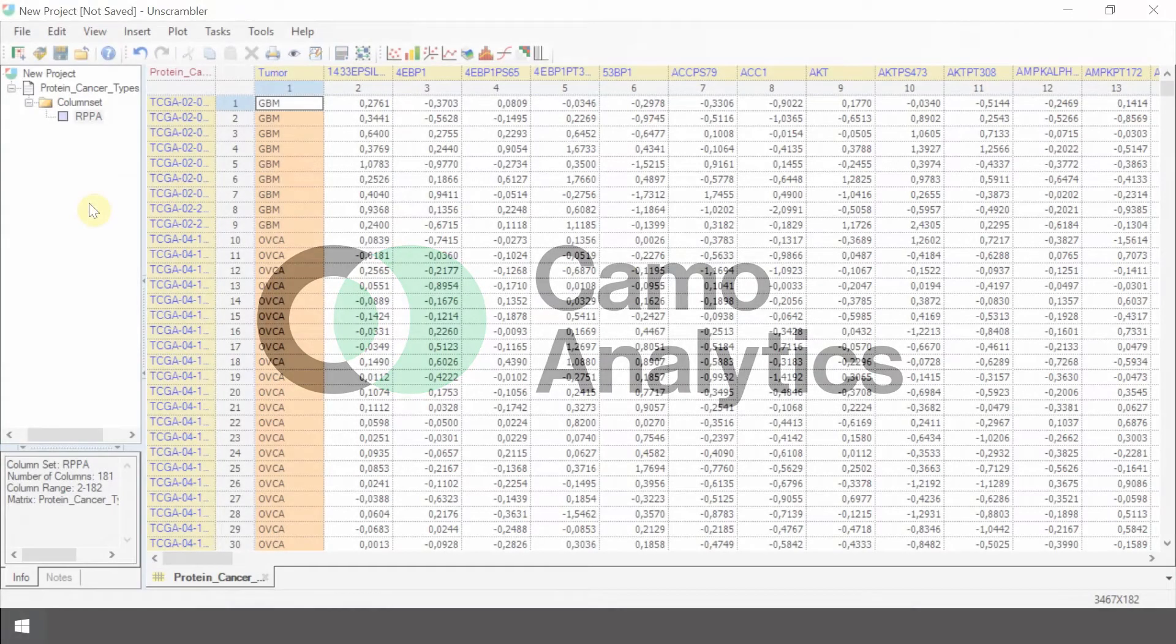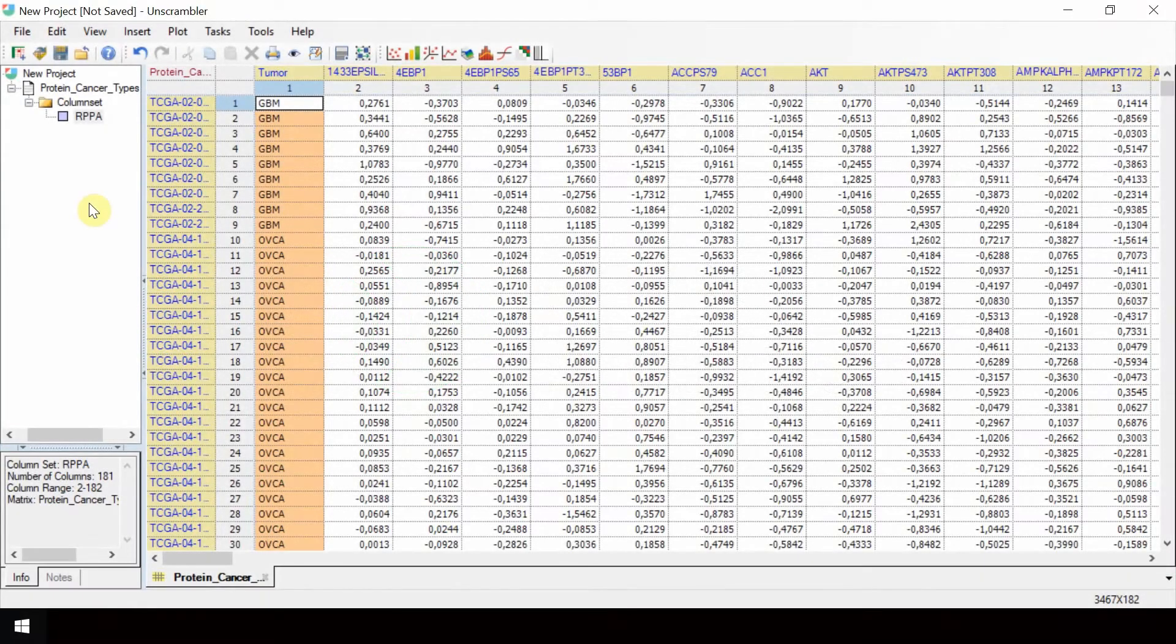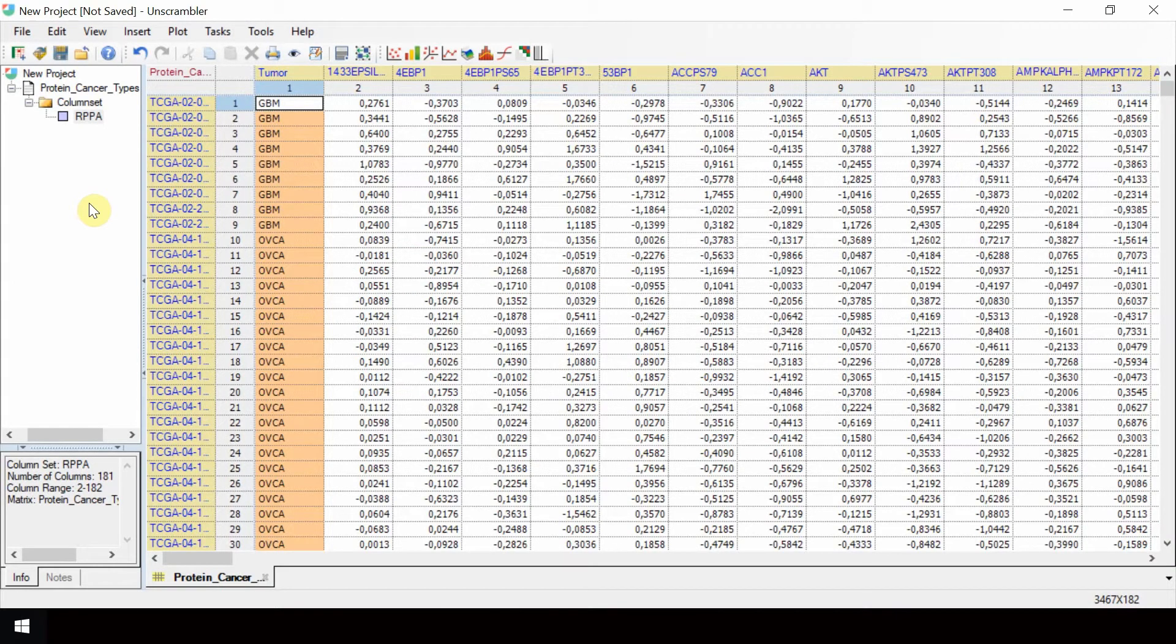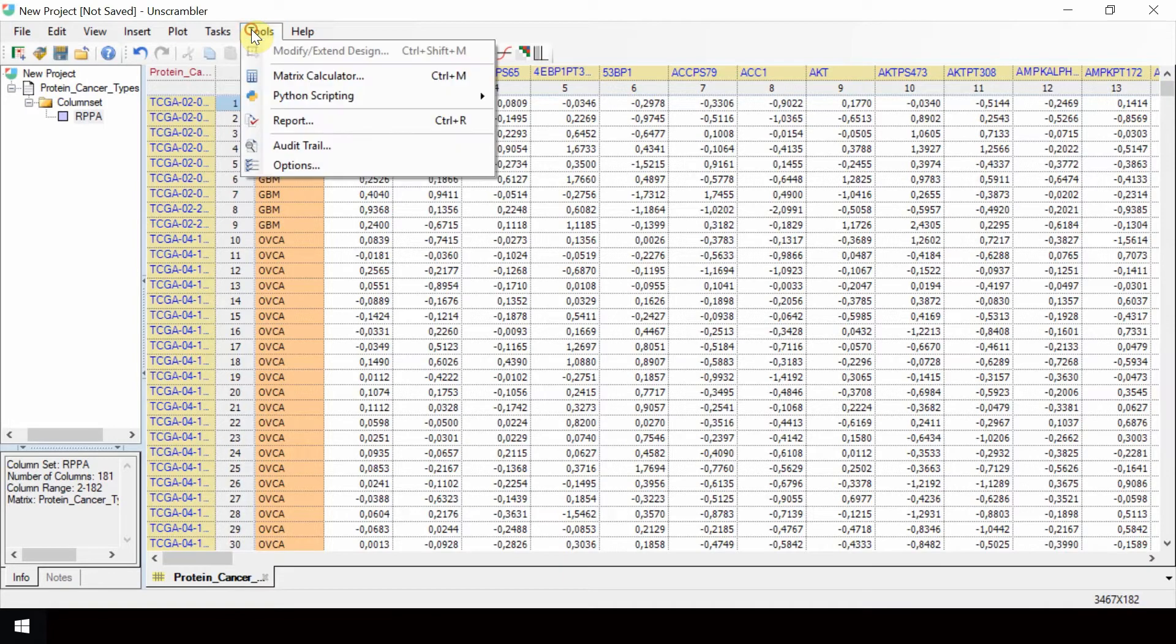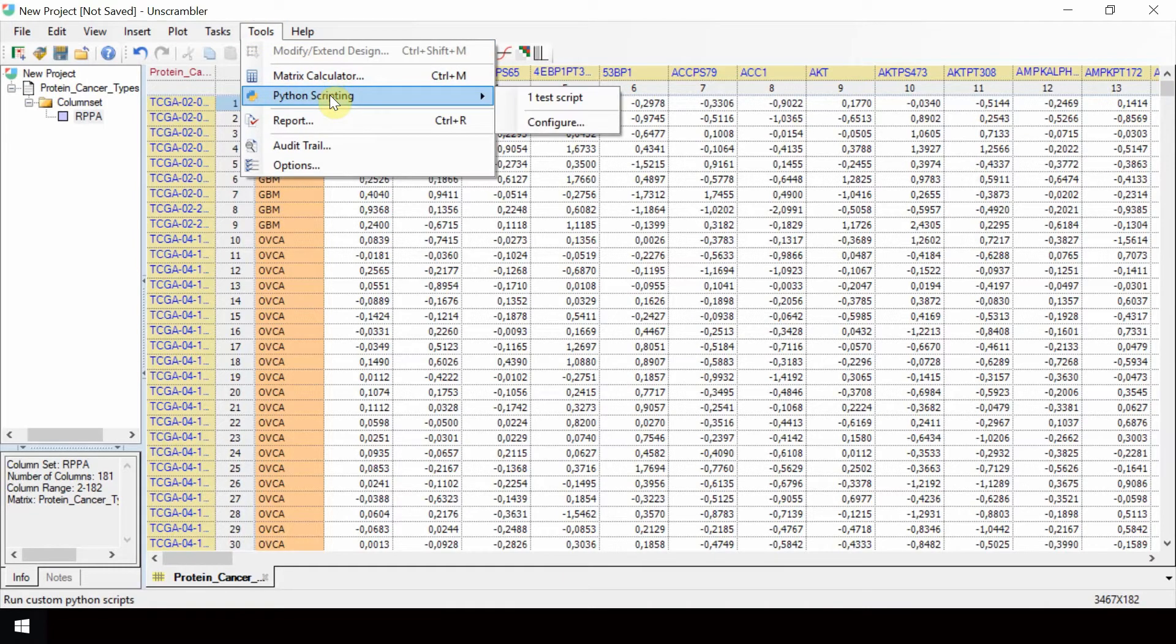This video shows how to create and run a configuration for the TISNY script. From Unscrambler, select Tools, Python Scripting, Configure.